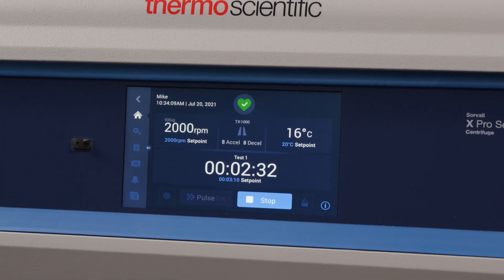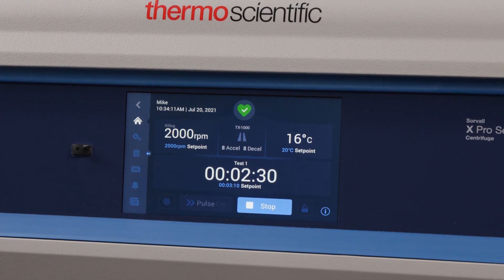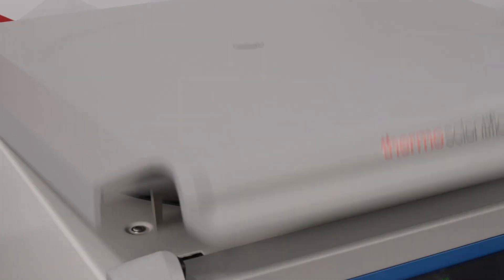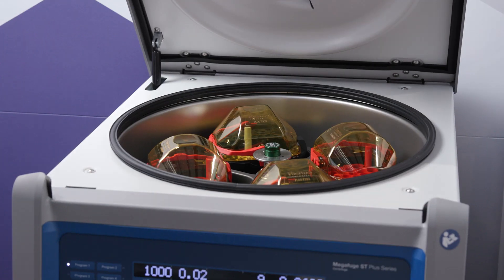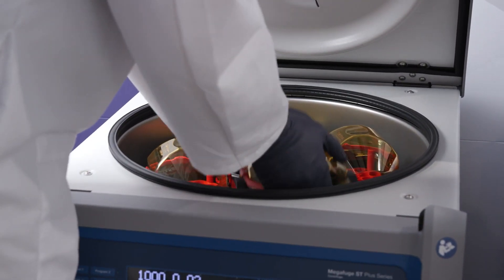On either unit the timer will begin when you hit the start button, but the X4 has the option to begin your timer at speed. On the X4 you have the options of about 17 different rotors, where on the ST4 you have the option of about 11.